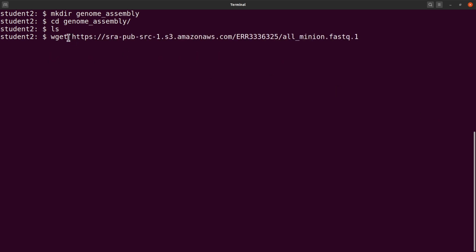Aside from wget, you can also use curl or other utilities to help you download stuff by supplying them with a link. So just look at one which works for you. But wget is popular and it's available on almost all Linux platforms. And you can also install it on macOS, so you can just use that to do the download. So just download and then let's get some stuff done. So let's do it.